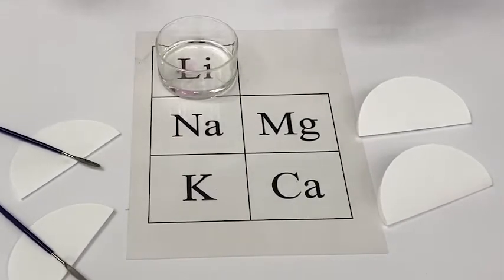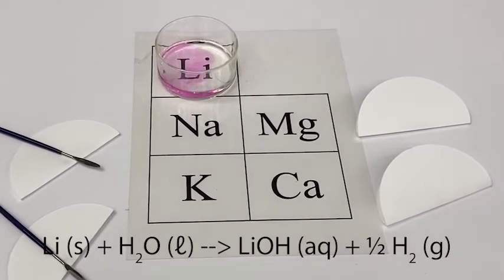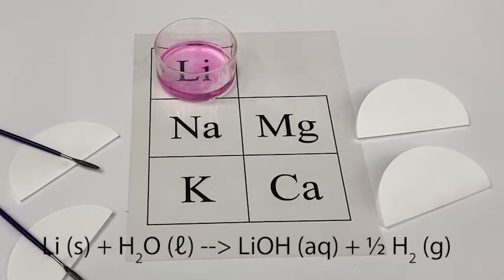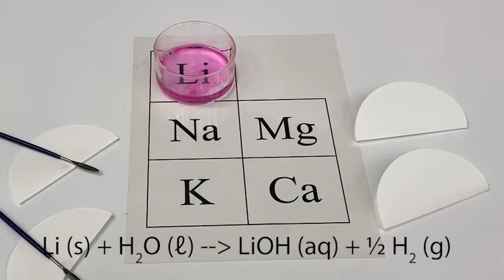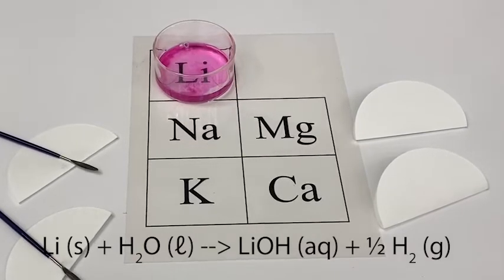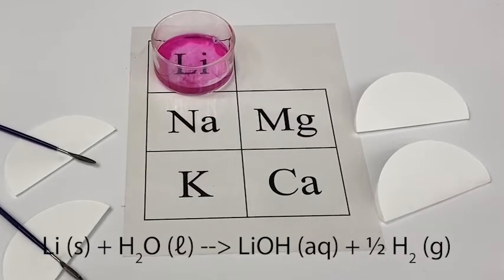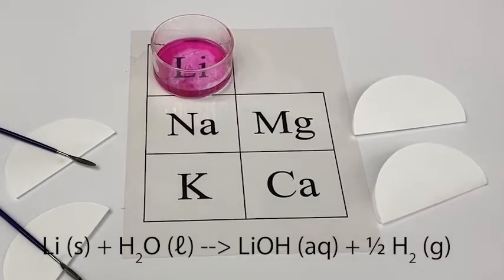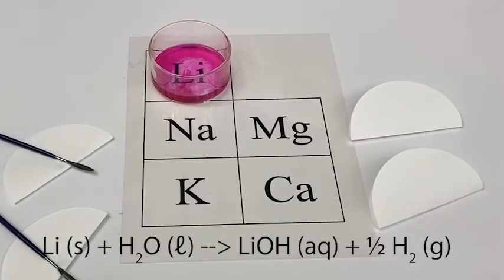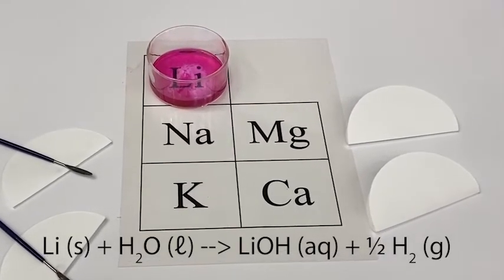Let's start with lithium. The reaction between alkali metals and water is spontaneous. It generates a base, lithium hydroxide, and hydrogen gas. You can see it's so vigorous that the lithium skitters around the dish.